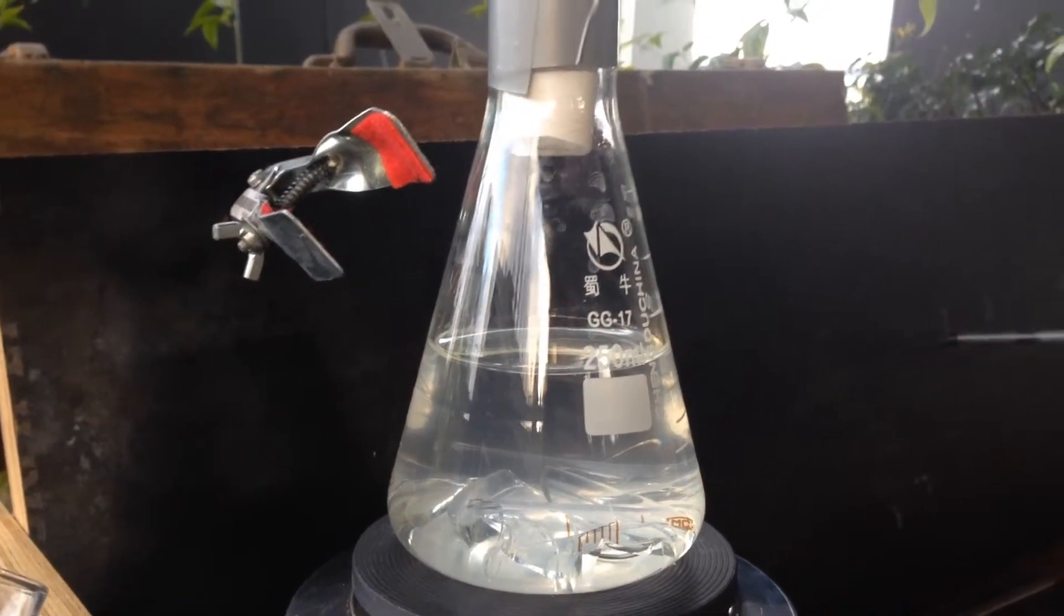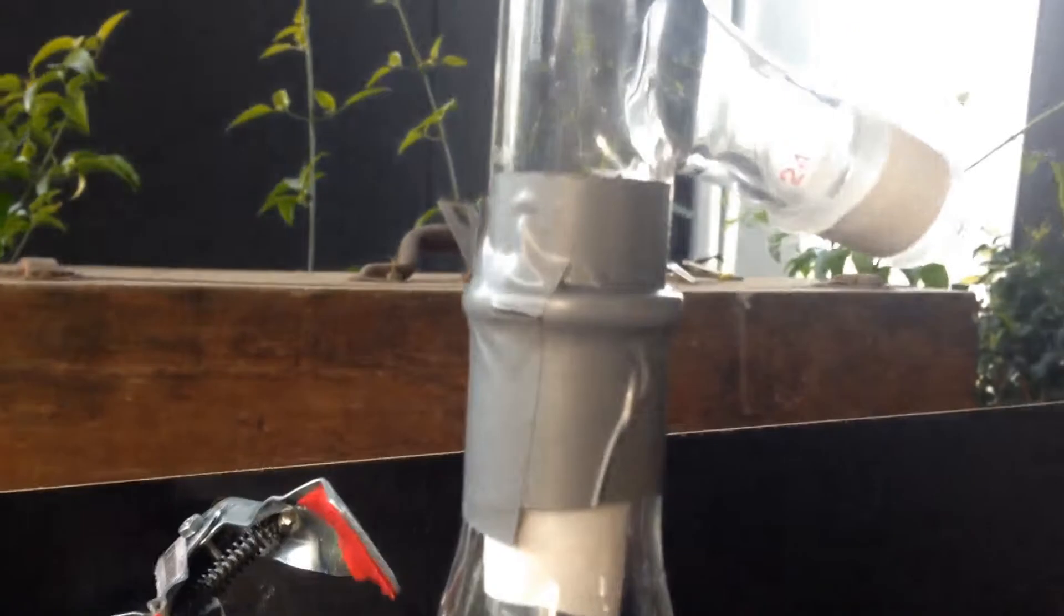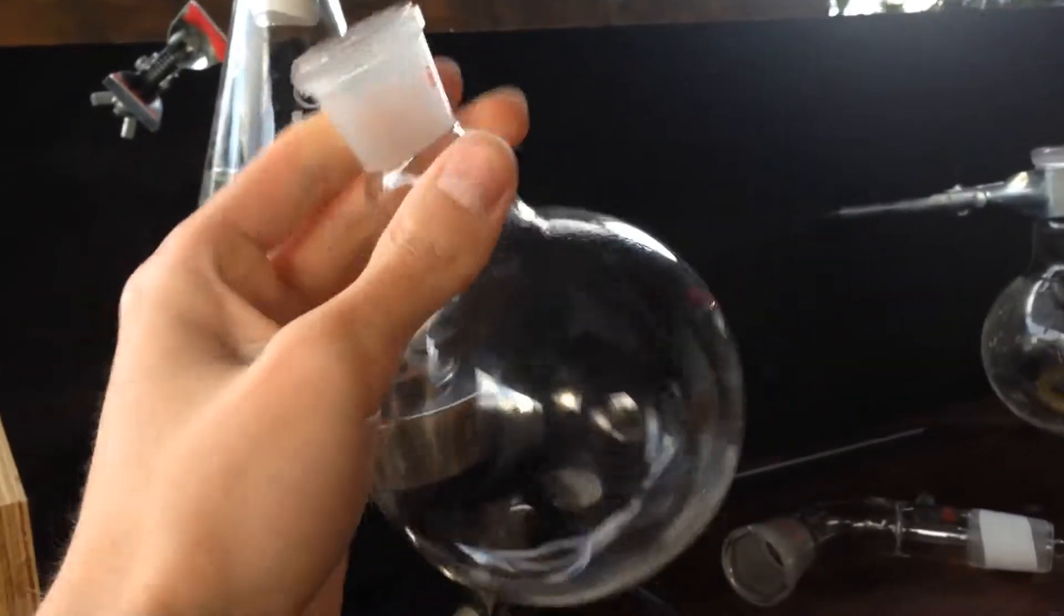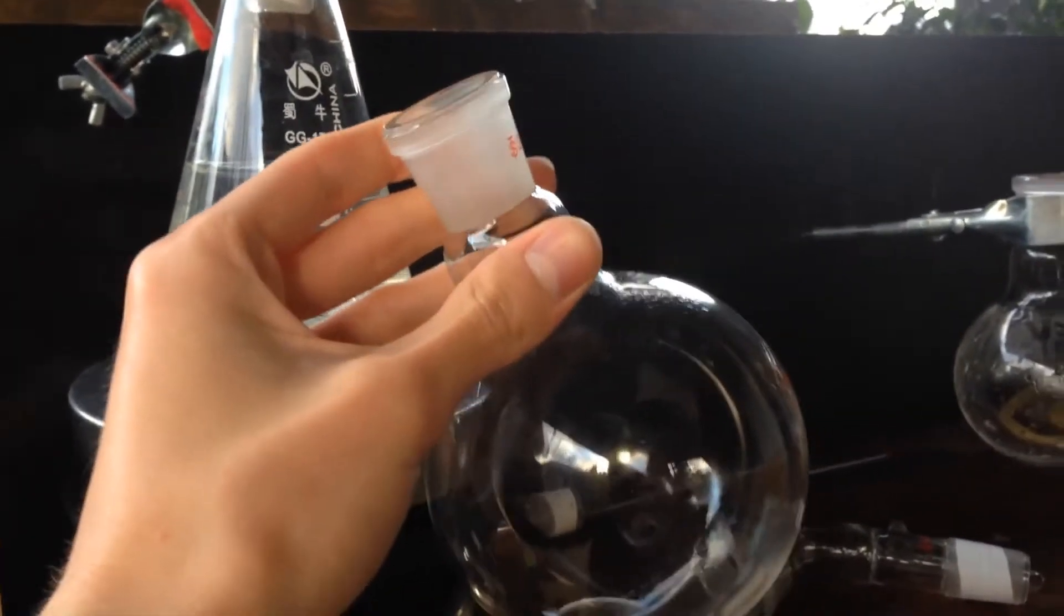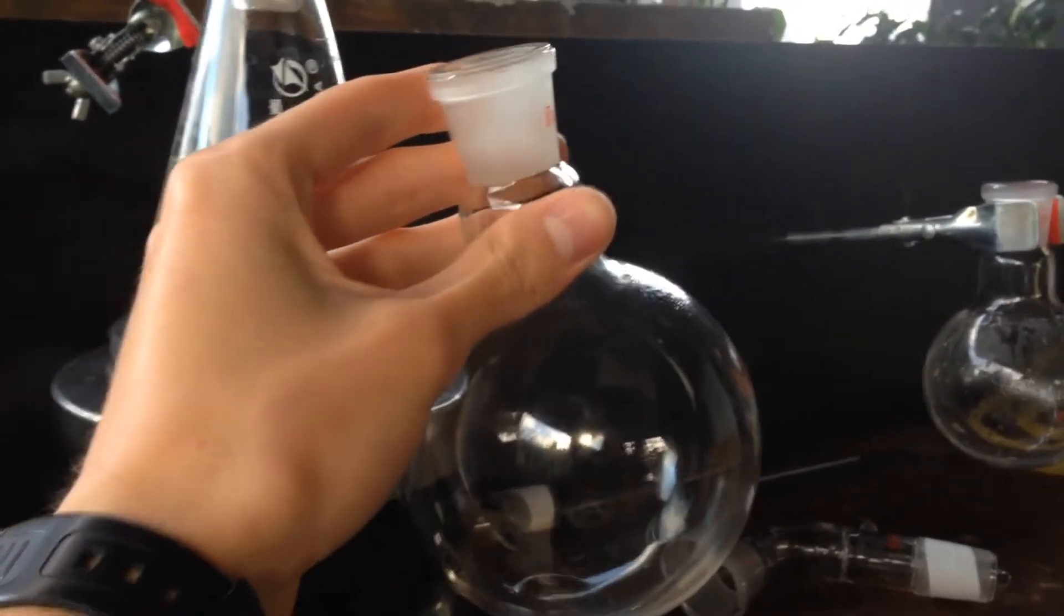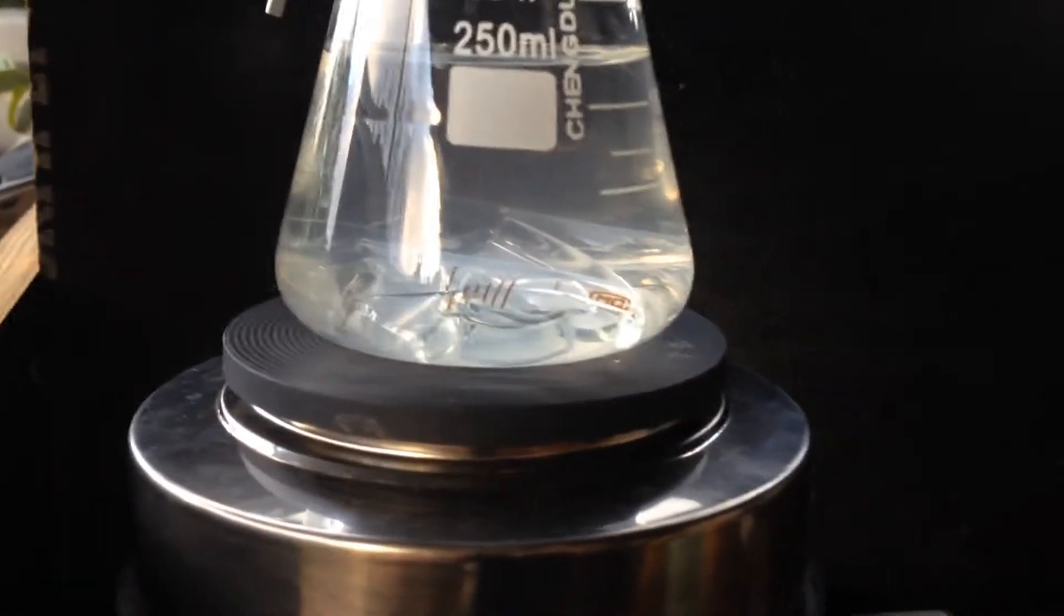In order to connect up the Erlenmeyer flask to the distillation setup, because it doesn't actually have an attachment that attaches onto these pieces, I've just duct taped it on. So originally, the distillation set came with this 500ml round bottom flask, but currently I don't really have a way to put it in a sand bath or an oil bath, so I'm just using an Erlenmeyer flask because I can get a lot more surface area touching the hot plate.